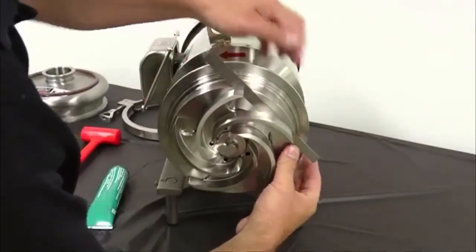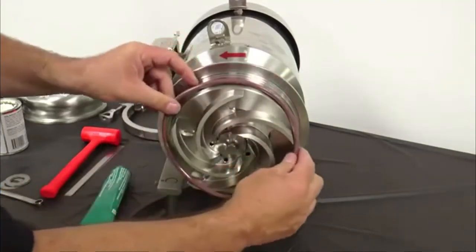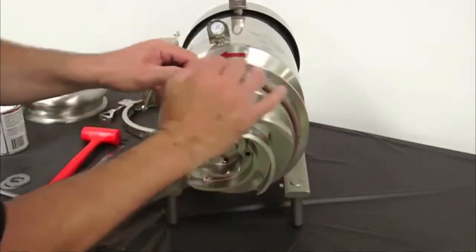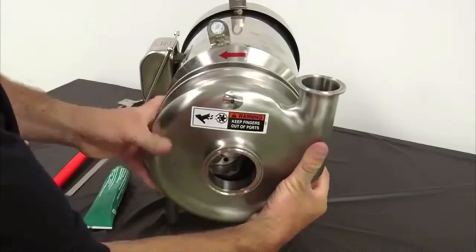While holding the back plate against the motor adapter, check the back face clearance between the impeller and the back plate — it should be 25 thousandths to 35 thousandths of an inch. Install the lubricated casing O-ring onto the back plate. Before installing the housing, rotate the back plate to align the seal housing flush ports with the holes in the motor adapter. Then install the casing by pressing it in place over the casing O-ring.